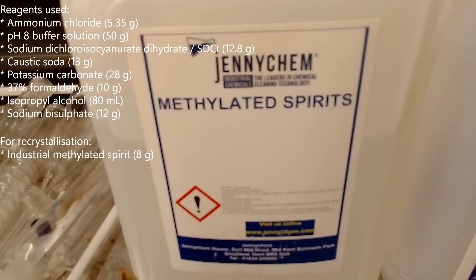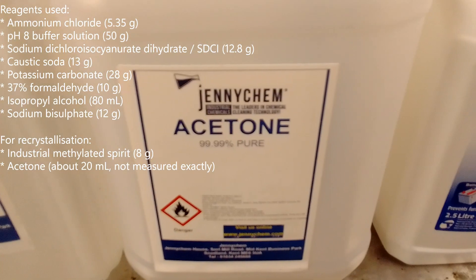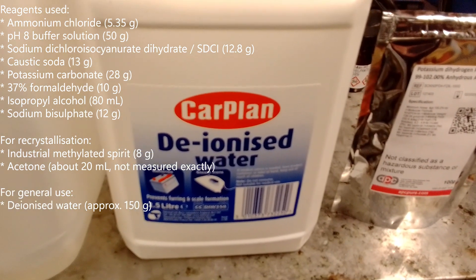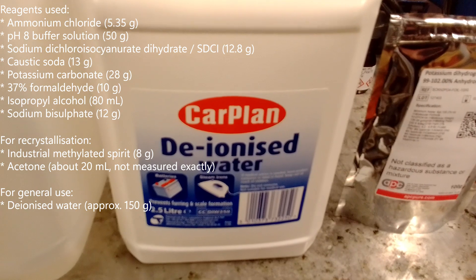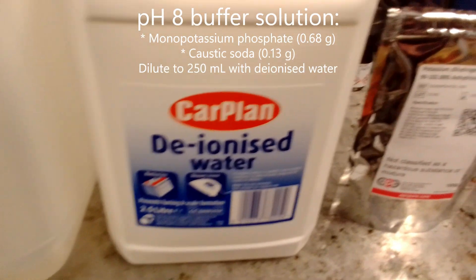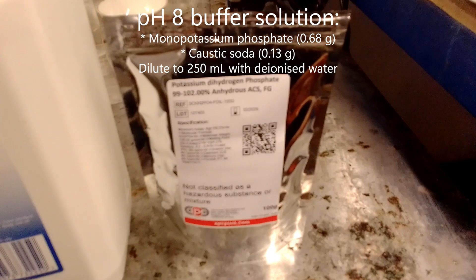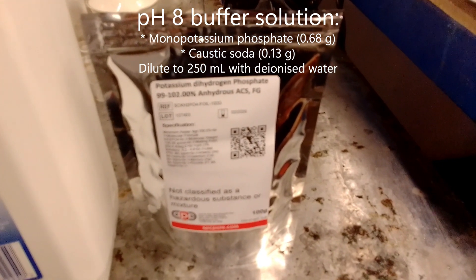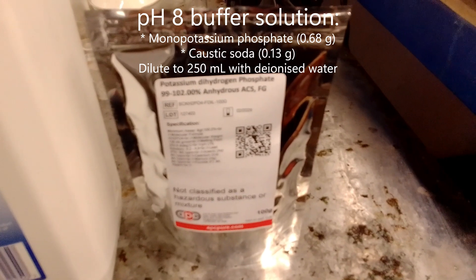For the recrystallization, industrial methylated spirit and acetone were also used, along with deionized water, about 150 grams in total. The buffer solution was made up using 0.68 grams of monopotassium phosphate and 0.13 grams of caustic soda, diluted to 250 ml with deionized water.